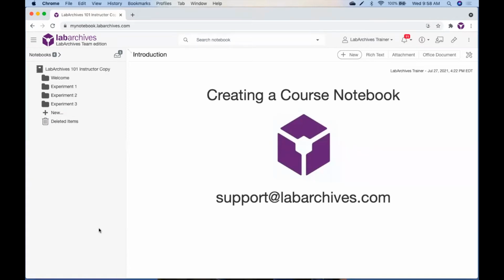Most instructors create a highly structured course notebook with a system of folders and pages to guide student work. A structured notebook can be easier for students that are new to LabArchives, and it can be faster to find student work. If you are not sure how to start, you may want to build a folder structure similar to the syllabus for your course. You can add pages within folders by clicking the folder and then this plus new button.